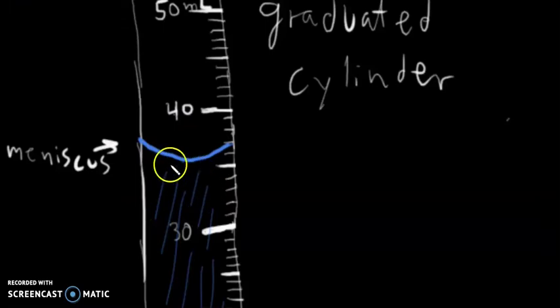And how do we do so? We measure it by taking the bottom of the meniscus as the point of reference, right? Because we have a scale on this side, and we want to use the scale to figure out how much volume of this liquid we have. And the point we use to tell that is the one that is right here at the bottom. In this case, we can check and see that it's falling somewhere on the lines there.